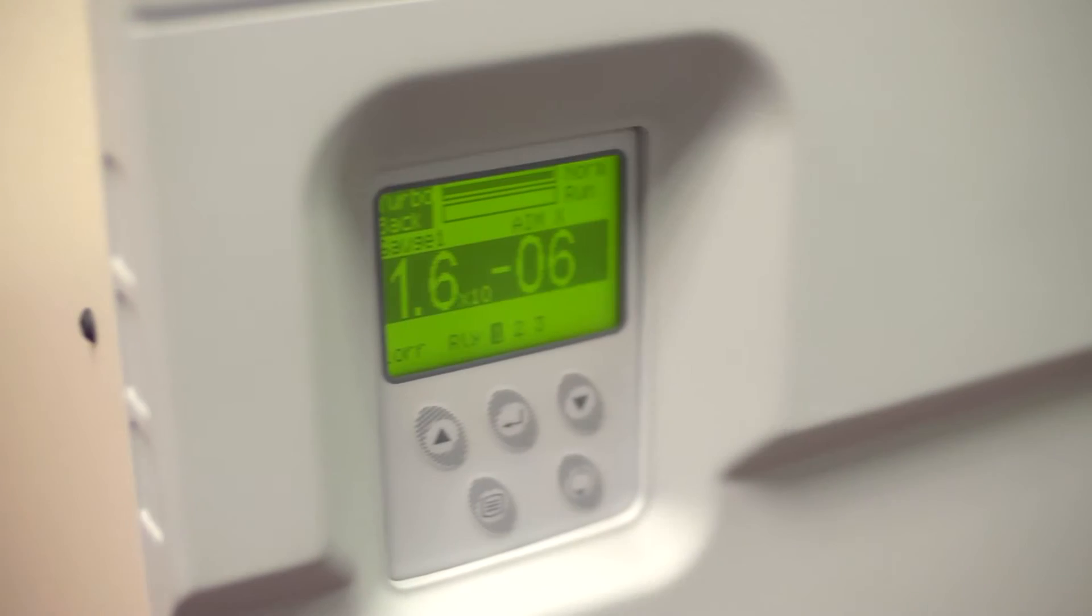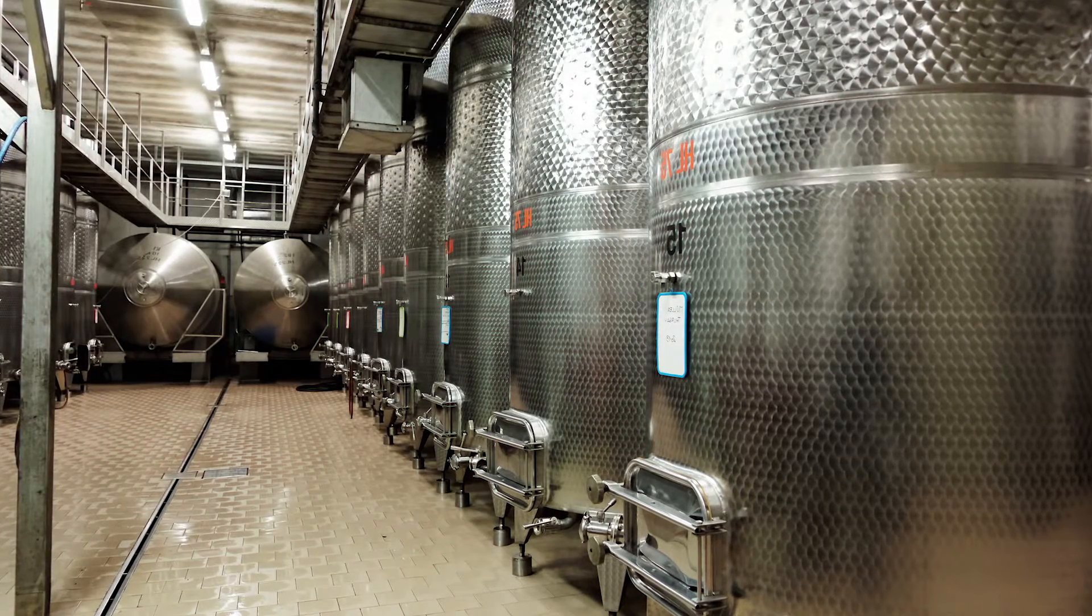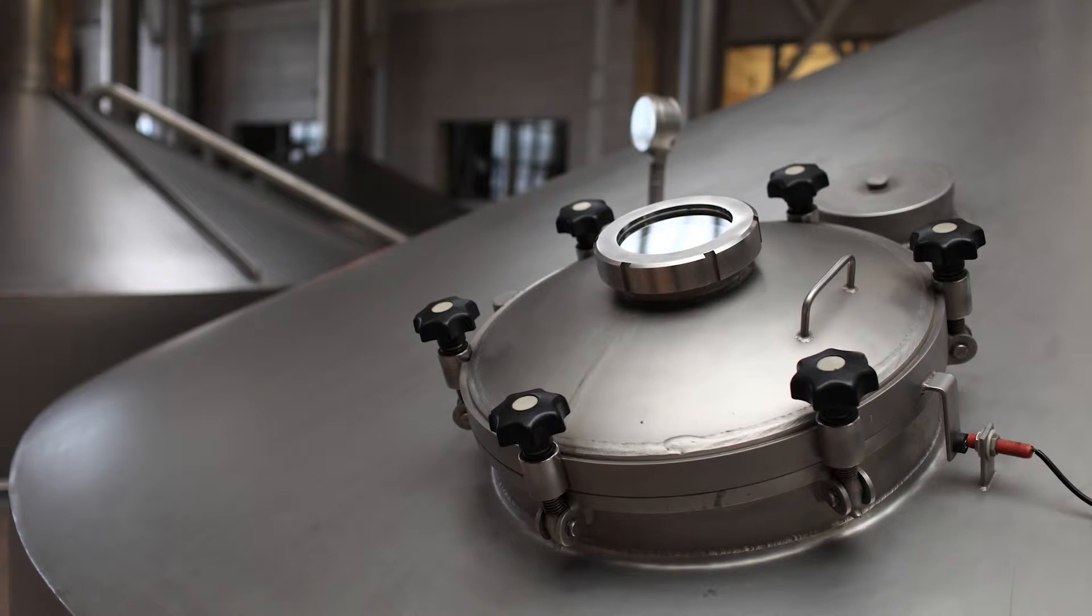The dynamic range of the instrument is 100% to 0.1 ppm, and in some applications that's really vital. In fermentation, for example, you can be analyzing nitrogen at 80% but needing to analyze ppm levels of volatiles and alcohols. This occurs across a range of gas analysis and processes where you want to analyze some species at the ppm level and some species approaching the percent level.